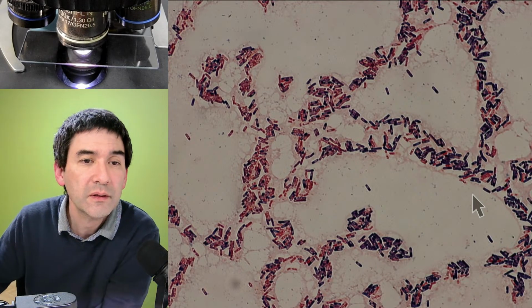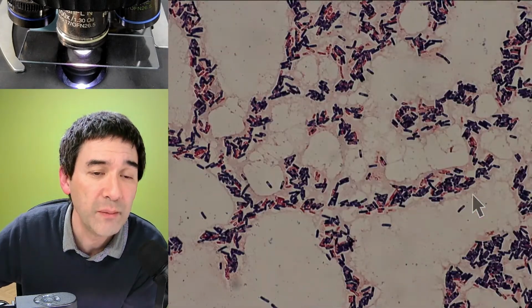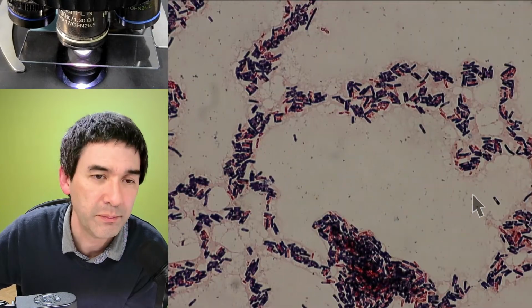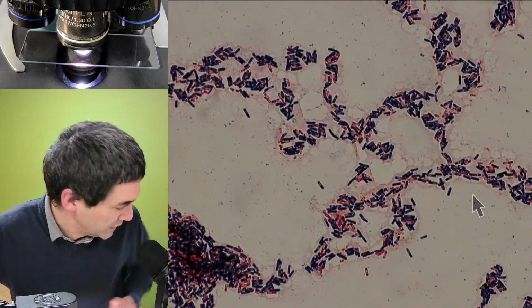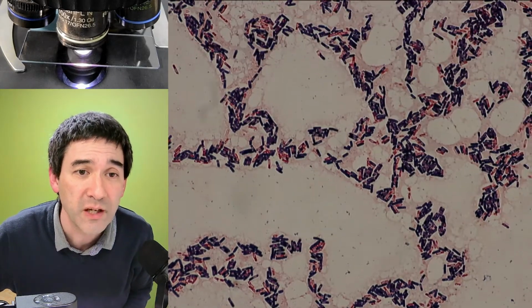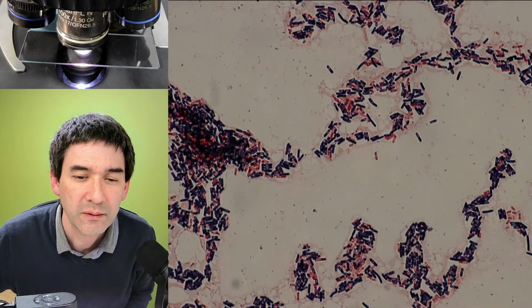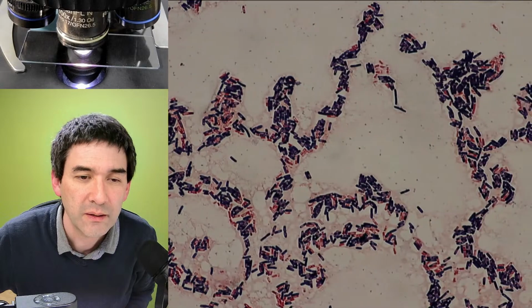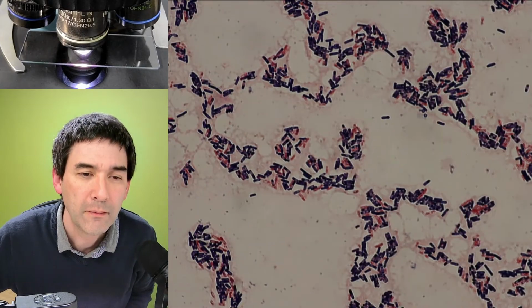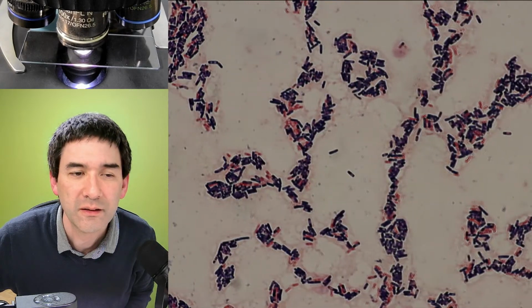You can also see that there is this mix between gram-positive and gram-negative. Here, mostly gram-positive. That's actually, by the way, remember the video or the picture that I quickly showed you at the beginning of this live stream? Yeah, this was actually the sample over here. So that's basically a demonstration of gram stain.